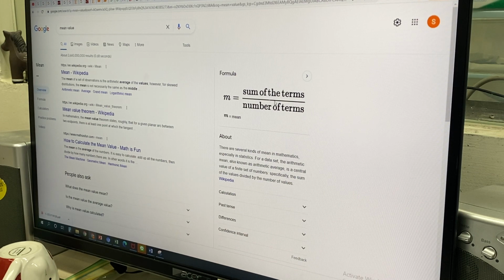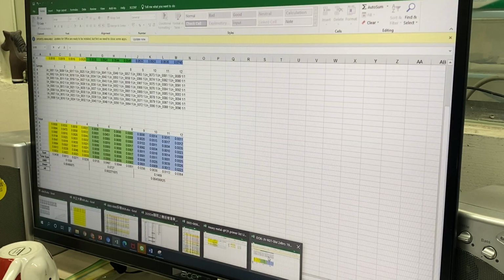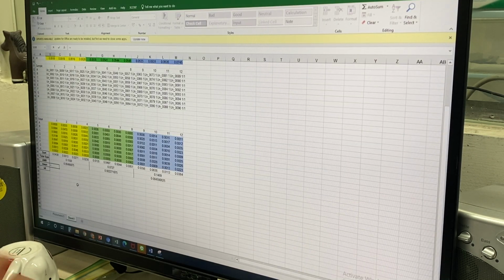Okay, so mean is the kind of this one. Do you got it? Yeah, I got it. So mean equals average.